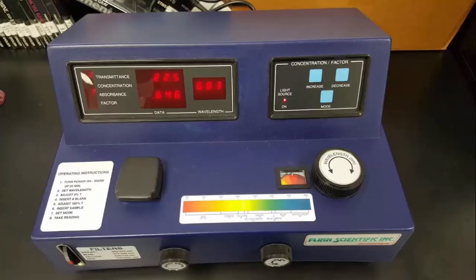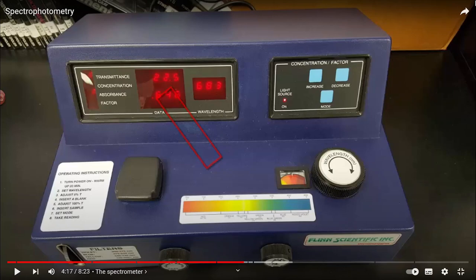This is just a picture of one of the spectrophotometers we have in our room. It's an older model. It's a kind of basic model made by Flynn. The ones you'll be using are slightly different, but they all have essentially the same parts. They have a little place where you can insert the sample. Then they have a number of ways that you can adjust the wavelength of light, and then a place where you can read the absorbance and percent transmittance. So if you're wondering where am I seeing the absorbance, it's going to be on the little digital display here.